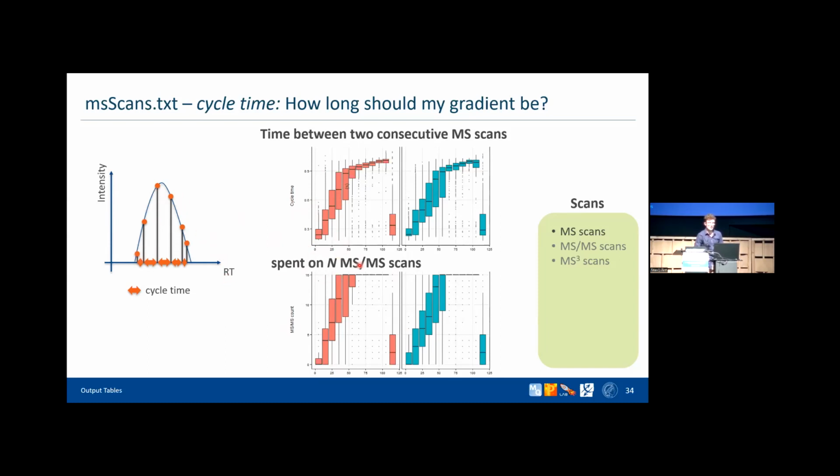So you might play around with your gradient to optimize this, to pull this a bit further down and this at the beginning a bit further up. Exactly. So if it looks like this, it's not optimal.